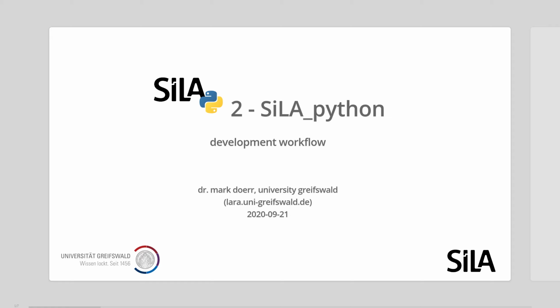Today I'm talking on a very high level about the SiLA Python development workflow, and in follow-up videos I will show in much more detail how you do all these steps.